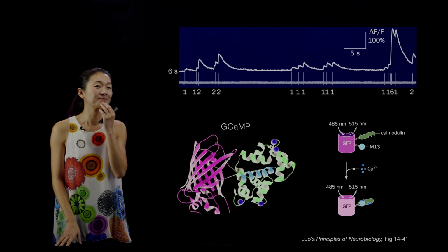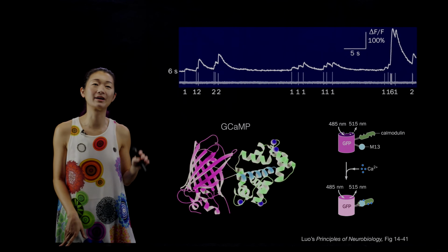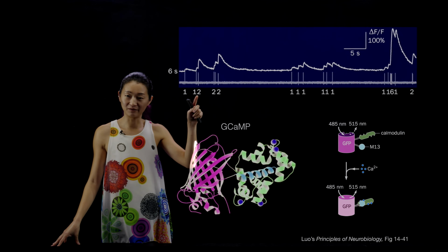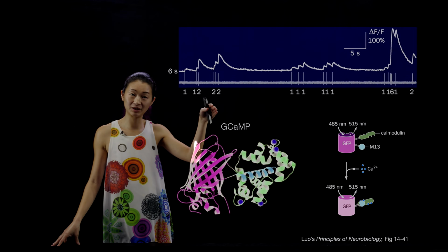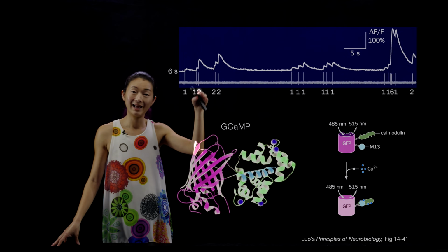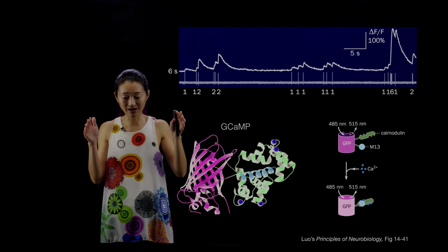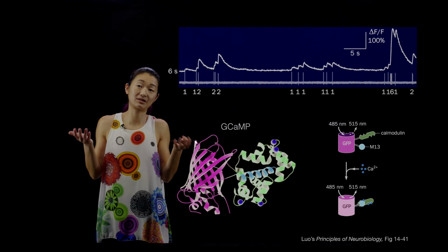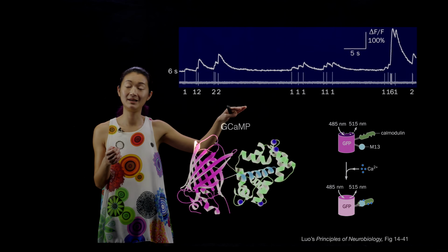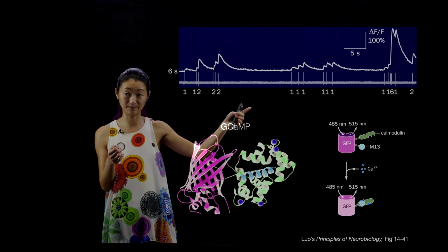So, all right, one more thing. If this point doesn't make sense to you, don't worry about it. It's kind of a quantitative point. If you look at the way that the GCaMP signal, this delta F over F signal, decays after every action potential, it does have a characteristic time scale and a characteristic shape. What it means is that if you know that filter, you can basically characterize it as a convolutional filter. So the GCaMP signal, delta F over F in time, is the product of a convolution filter applied to my action potentials in time.